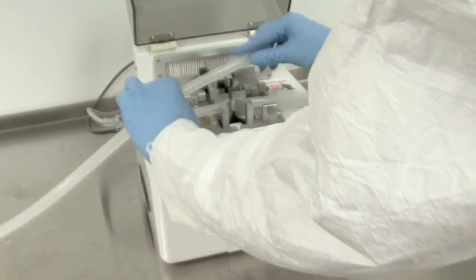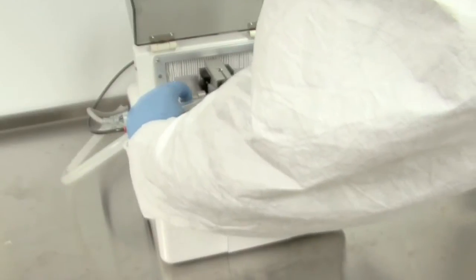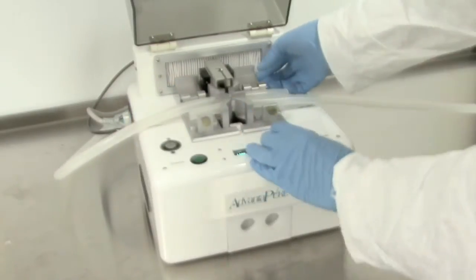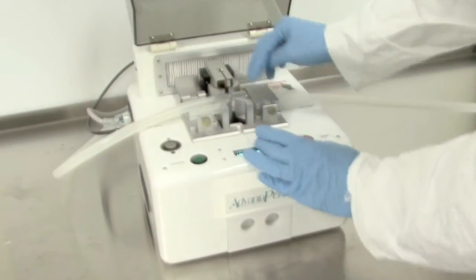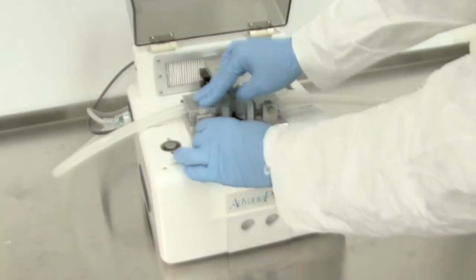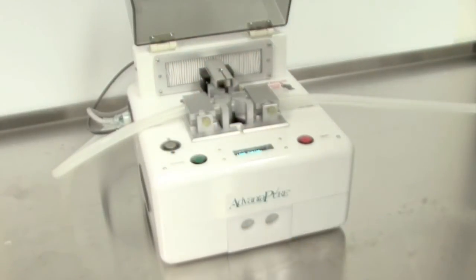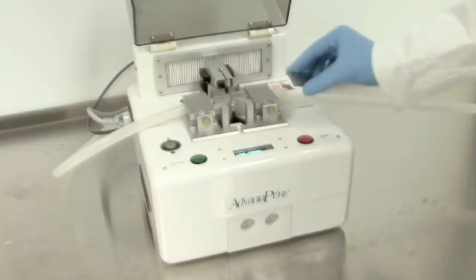Single-use cutting blades, which are heat sterilized within the machine prior to use, help assure sterility. After a technician positions the tubing between one set of clamps, it is secured in place with another set. A new blade is inserted.